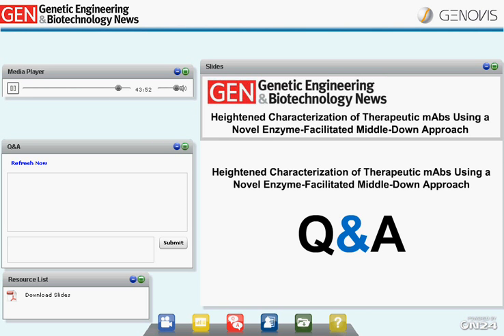All right, so the next question someone asked is, can it be used for rodent IgGs? Yeah, we know that, for example, IgG2A and IgG3 of mouse works. We haven't really tested, let's say, rat, and I'm not aware of anyone who has done that successfully either.